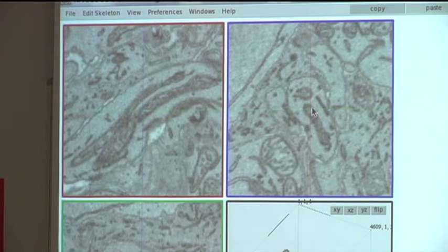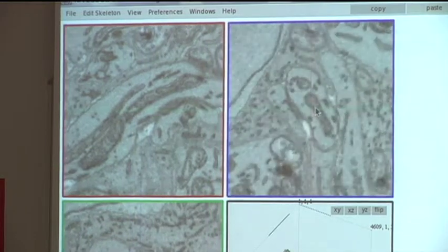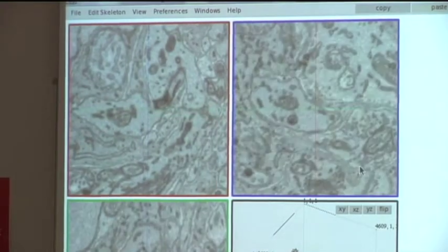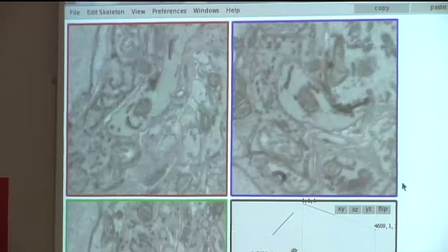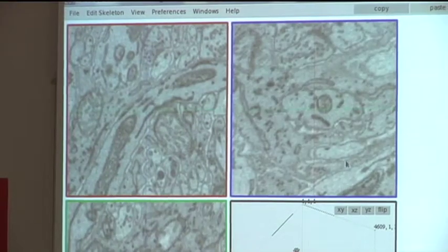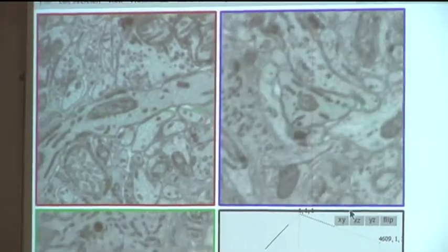So this is a stopwatch. Okay, so ready, steady, go. Okay, and everybody follows this right window up there. Can you see it? And he's very nicely following the right. Ugly mito in view, but no problem because he's still oriented. Very good. Now the neurite starts traveling, as you can see, right? Oh, too fast. Yeah, whatever. Take your time if you need it, but it is competitive.